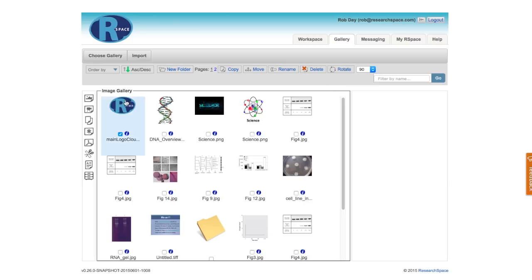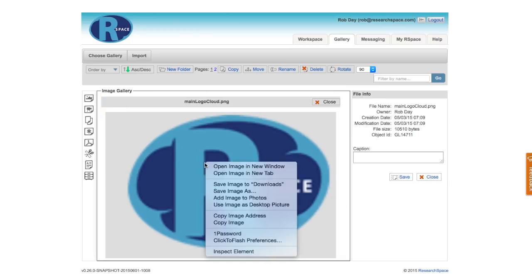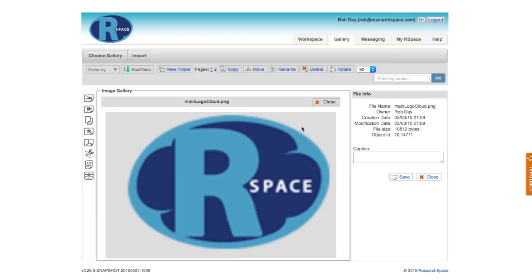In the image gallery, I can click on an image to see a larger preview, and then I can right click on that image to download the image straight to my local computer, or open it in a new tab or a new window.